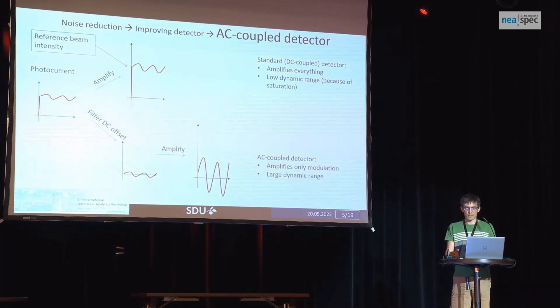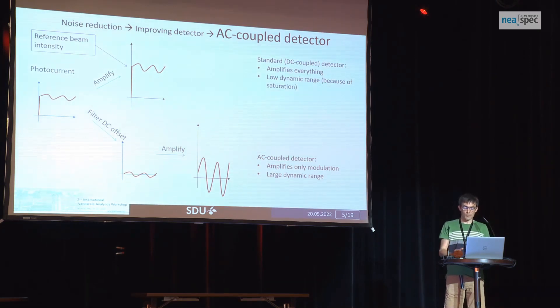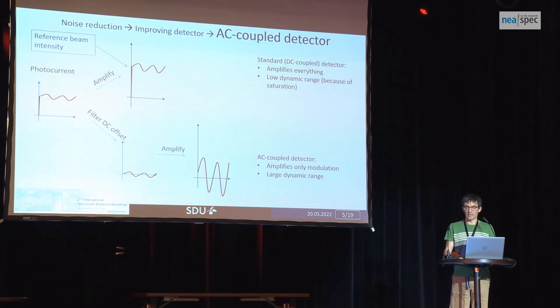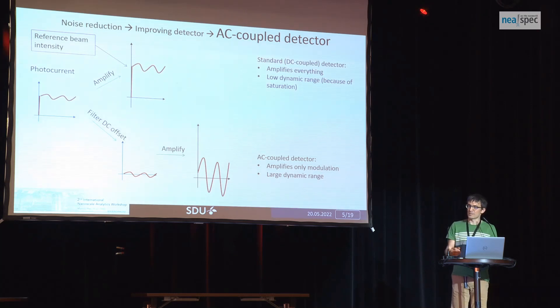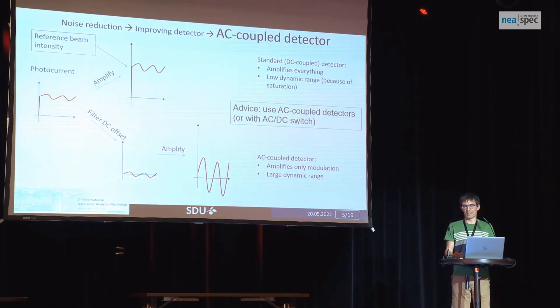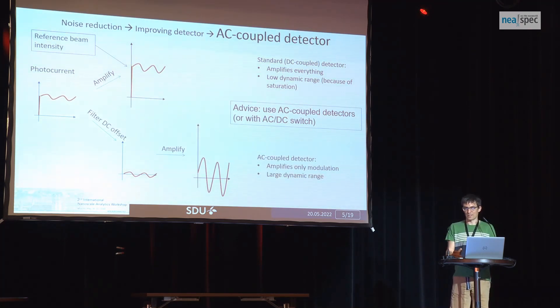Therefore, the solution is to use AC coupled detectors. First, it removes the large DC offset and only amplifies the variation in time — which in our case is the modulation introduced by the interference from scattering of the tip. With an AC detector, you have no issue with saturation because the interference term is very small. You can amplify as much as you want, until you reach the bandwidth limit. The advice is simple: use an AC coupled detector. And if you're lucky enough to find one with an AC/DC switch on the market, that's the best choice.